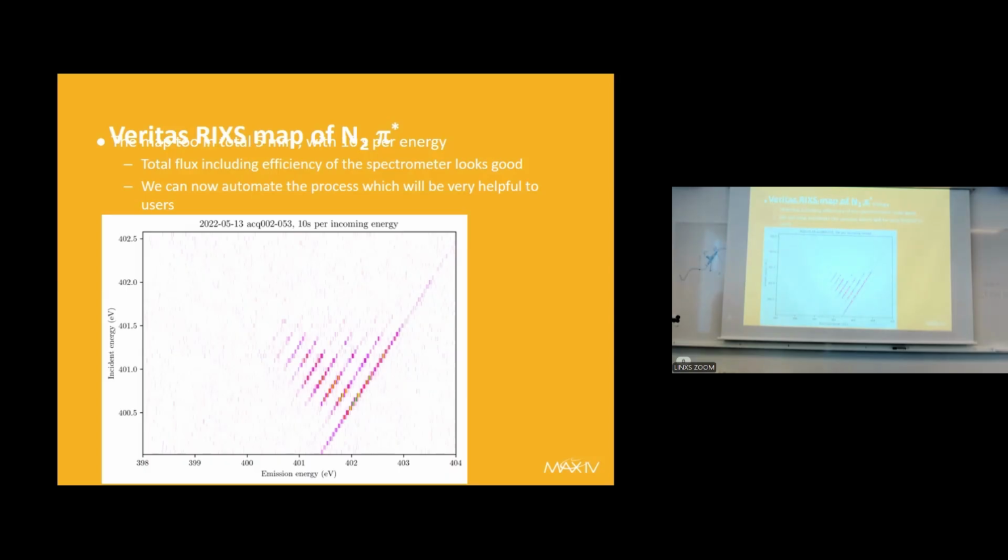And Anirudh, again, also has a separate section on data analysis, and you're going to do a practical at Veritas. Essentially, because everything is so time consuming, we record the spectra and then you can replay them in software afterwards and play around with the data that you got. This means you can also go in and see if things went wrong. If you see something completely unexpected, you can double check your excitation energy, or whether something happened in the synchrotron at the same time, and so on. All of these are important because this is just minutes, but expect your experiments to take at least 20 minutes or hours, depending on your sample.